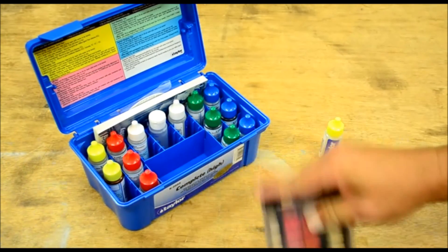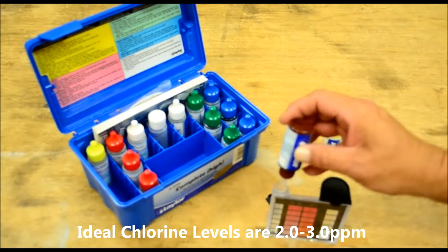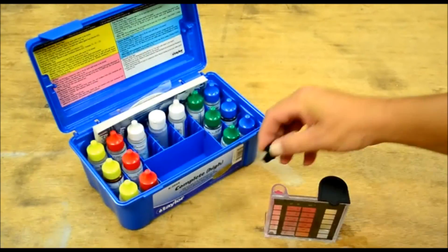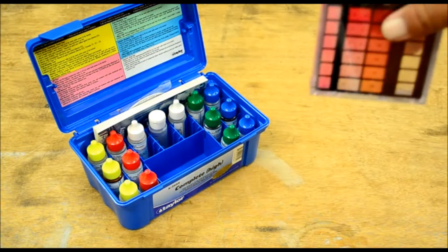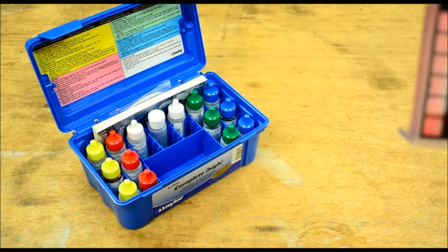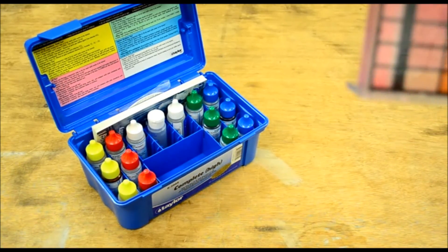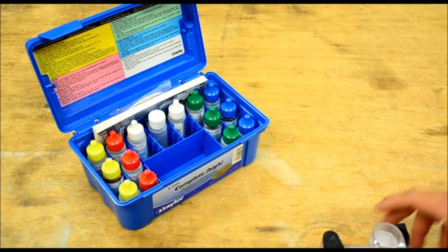Now use a little rubber cap and get reagent number two — straight down, five drops — one, two, three, four, five. Put your cap on and mix it up. You want to hold it up to a light surface; if you're outside you can hold it up to the sky. According to this we are right at about three parts per million, so we're dead on where we need to be on our chlorine.